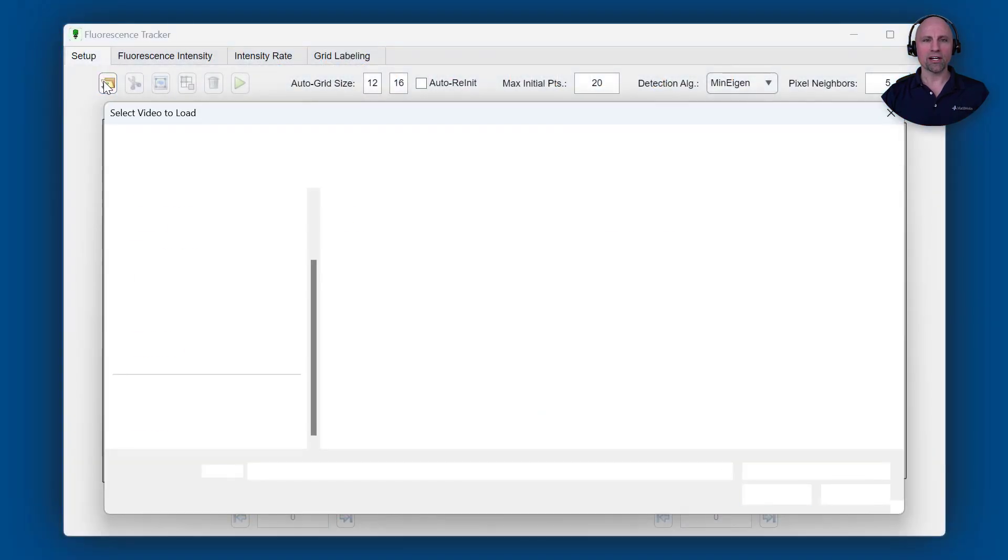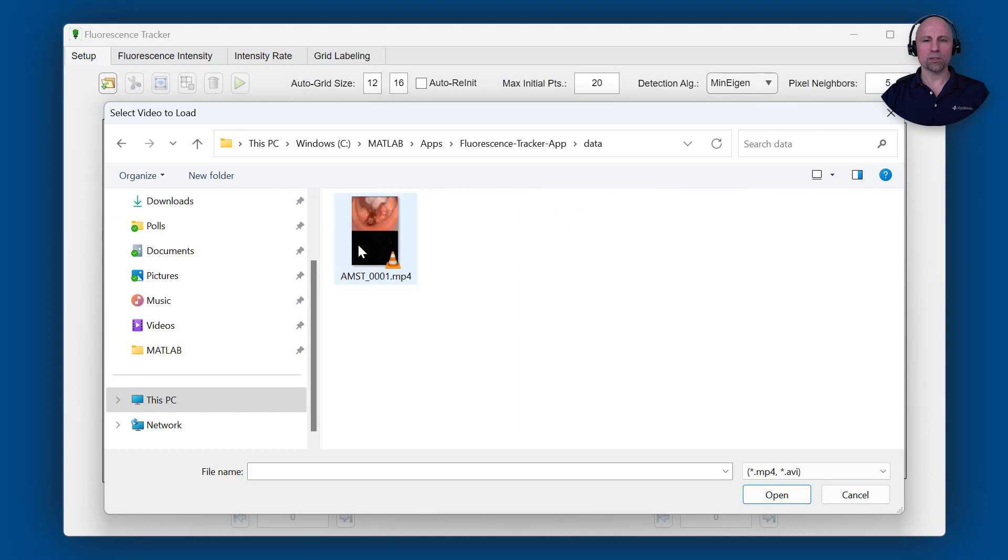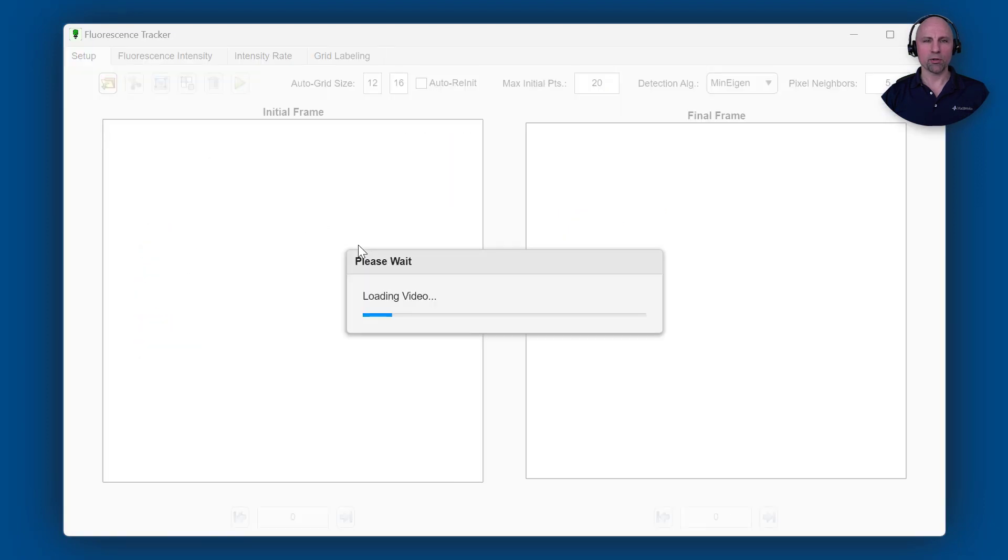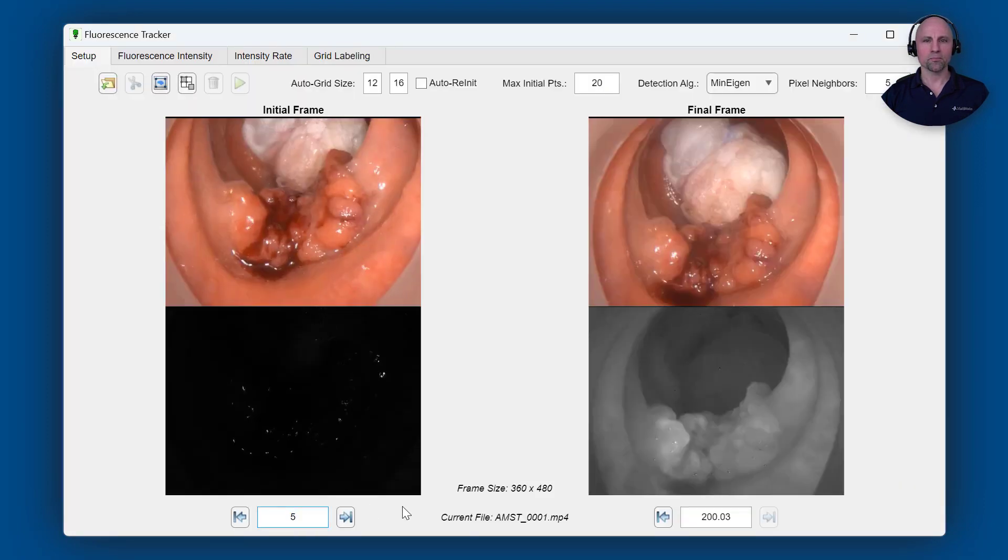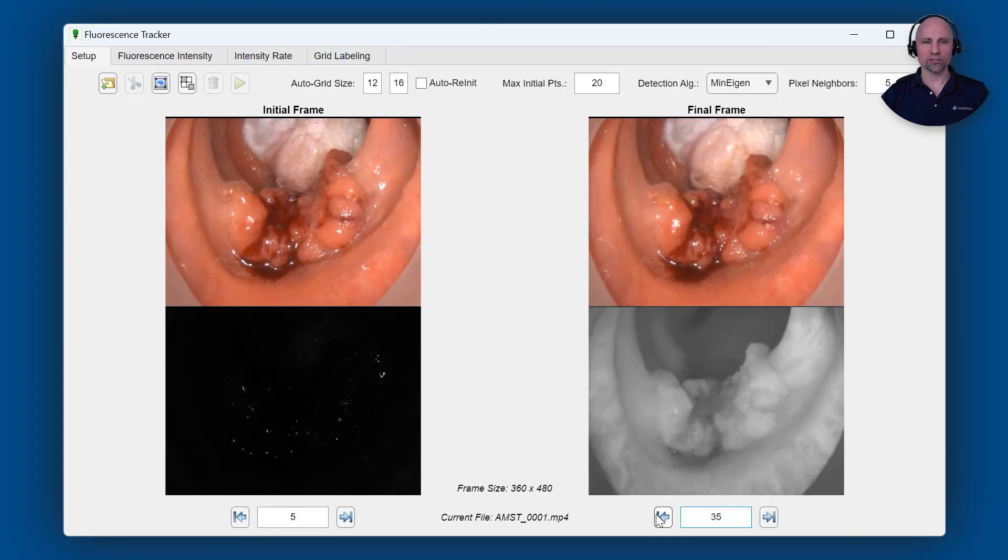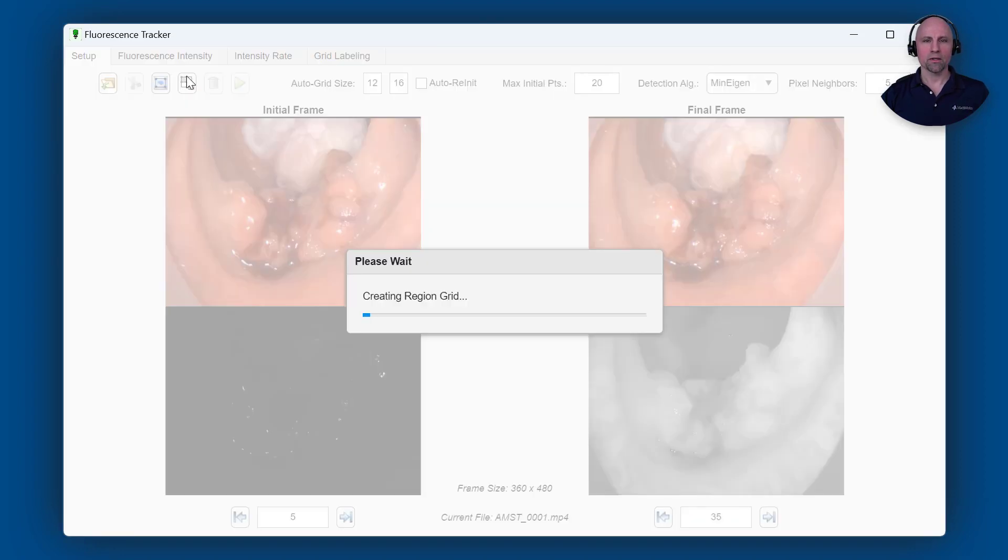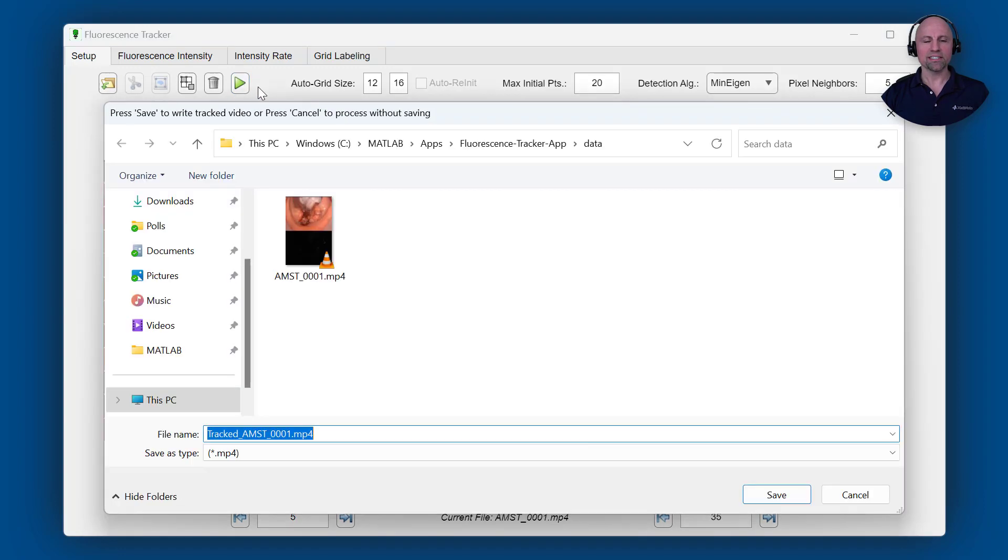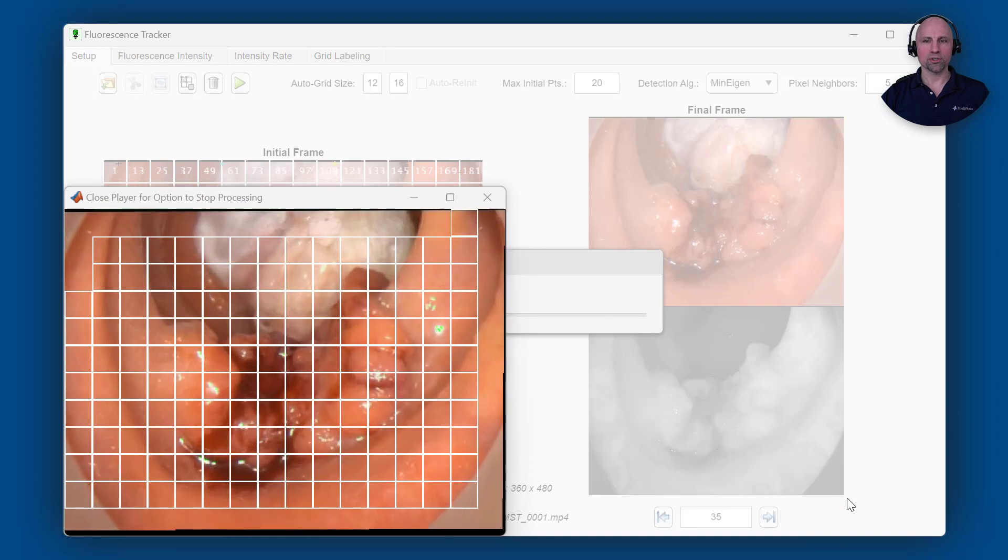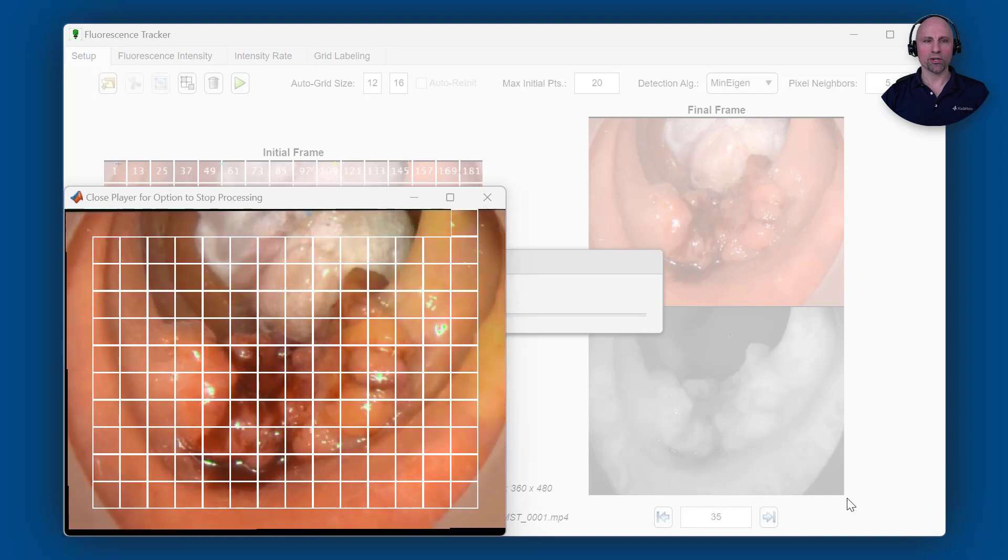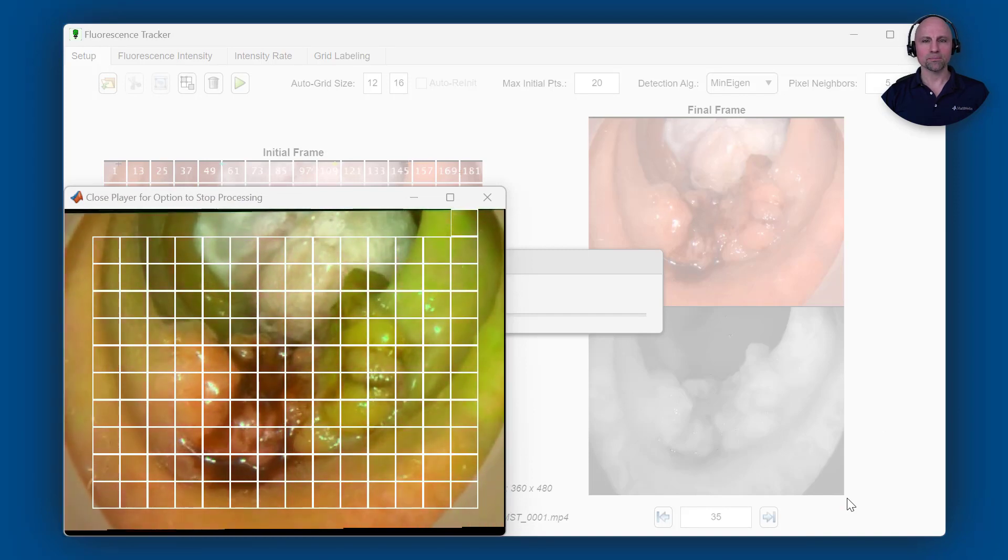The fluorescence tracker app you see here has been updated to provide an alternative approach to automate data collection for their analysis. Once again, feature points are automatically detected and tracked between video frames. However, instead of specifying regions of interest, these control points are spread across the entire video frame and used to compute the transform between the current point locations and the initial point locations.